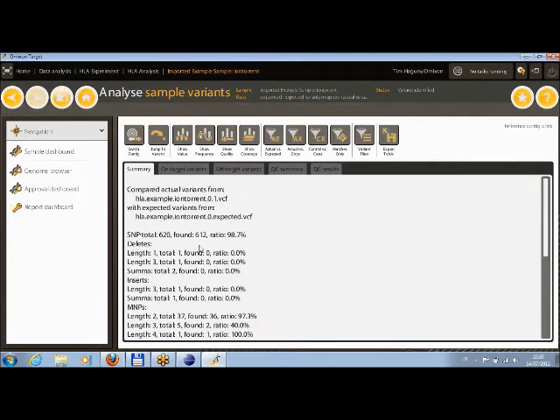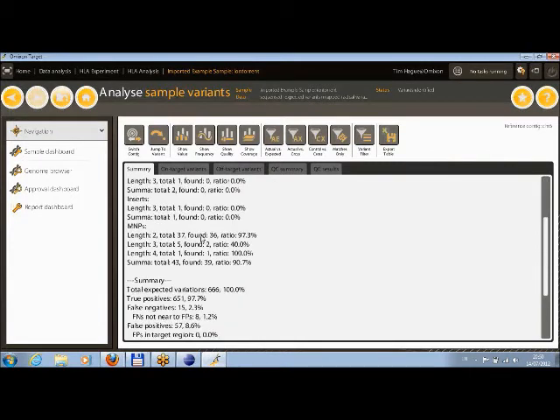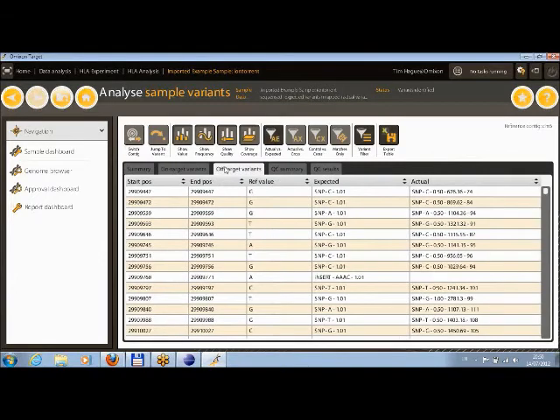This is a particularly noisy data set for demonstration purposes, so that we have something to show in this view. Now we automatically screen this by on-target variants and off-target variants.